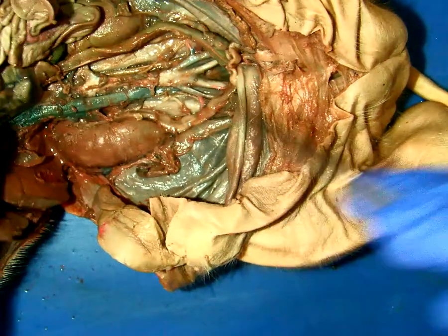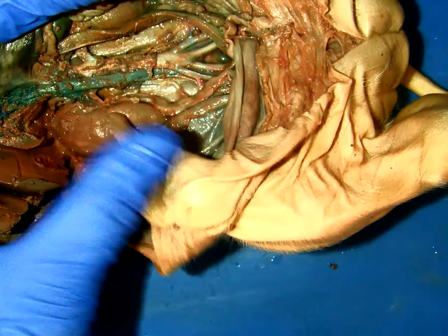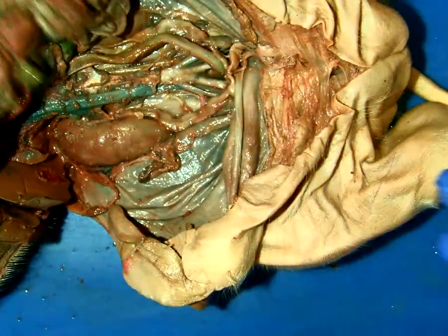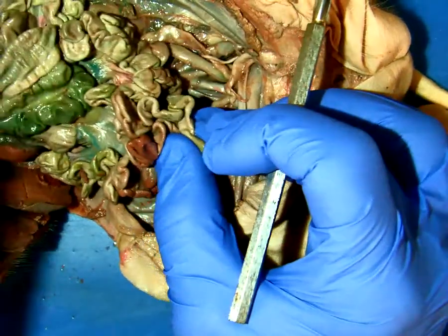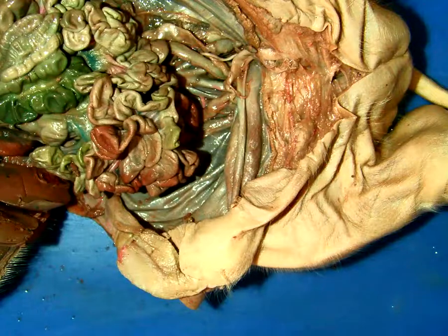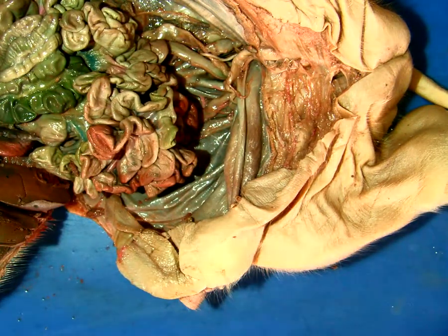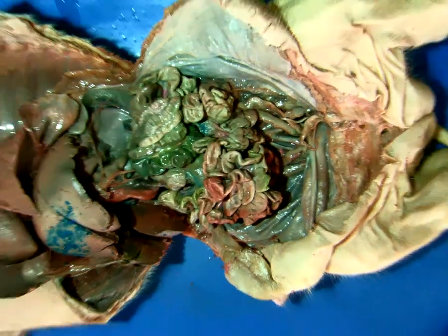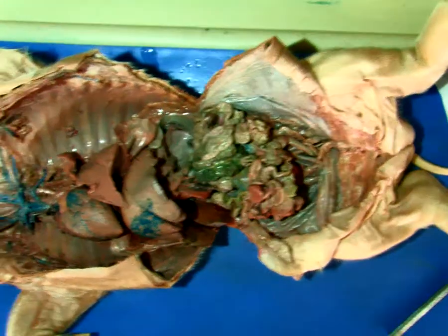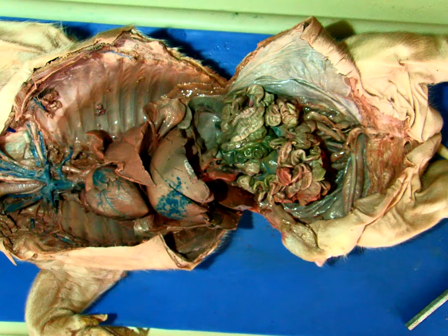All right? And then, like I said, there's other vessels that branch like you do up here, but we want to keep all the viscera intact. We want the intestines here, here's small intestines, large intestines. So we're not going to bother to try to get that named for you guys. I hope to some degree, we'll zoom out to get a big picture. Okay. I hope to some degree this helps and doesn't confuse you. Again, this is a really good pig, probably a pig that'll be used on the practical. I'll take some stills, and good luck.